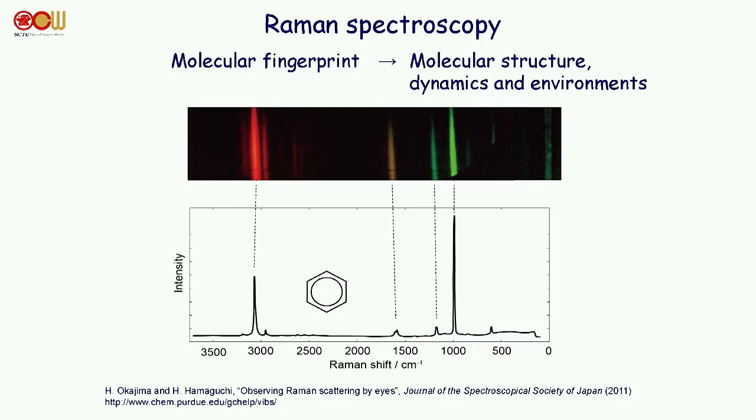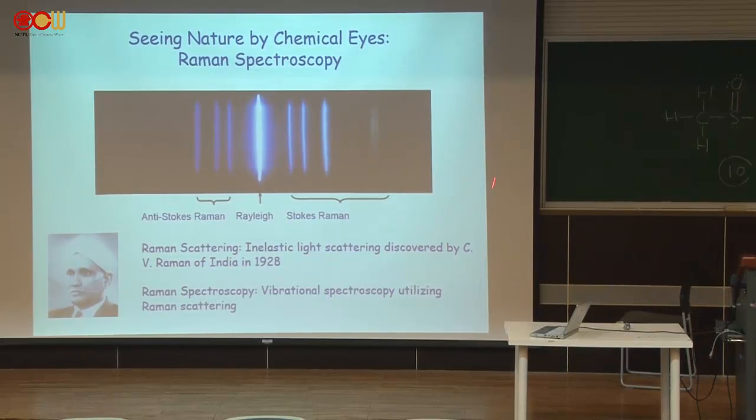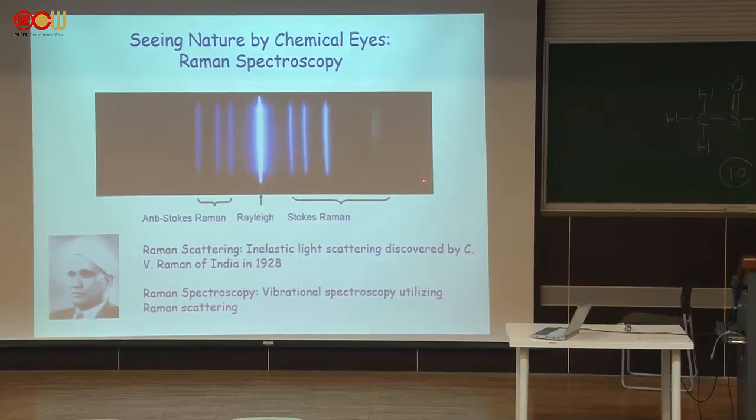Okay? If you come back to the previous one, here it's overexposure, so it's white. But you know, here it's more violet, here it is more blue, and here you may see green. Okay? But if you go further, then it becomes yellow and even red.